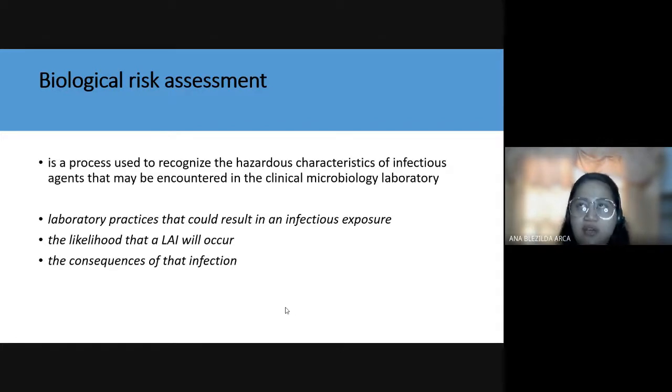For example, you are processing a bacteria, pero hindi ka gumamit ng biosafety cabinet, 'di ba? Sabi ko nga kanina, whenever you process bacteria, always process inside the biosafety cabinet. Pasaway ka, hindi mo ginawa. That's an example na na-expose ka, 'di ba?